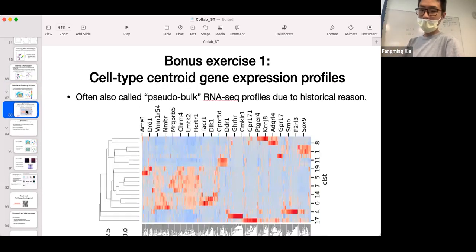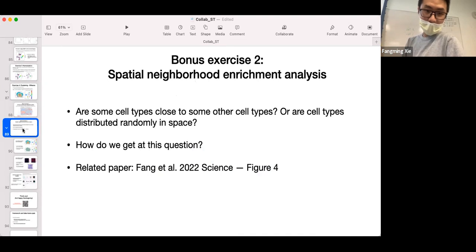So that's clustering. That's how we pull out the genes, the central profile of each cluster. Finally, I don't think I'll demo it because it's close to 3:30 right now. But if you're interested, stay and I can show you later.